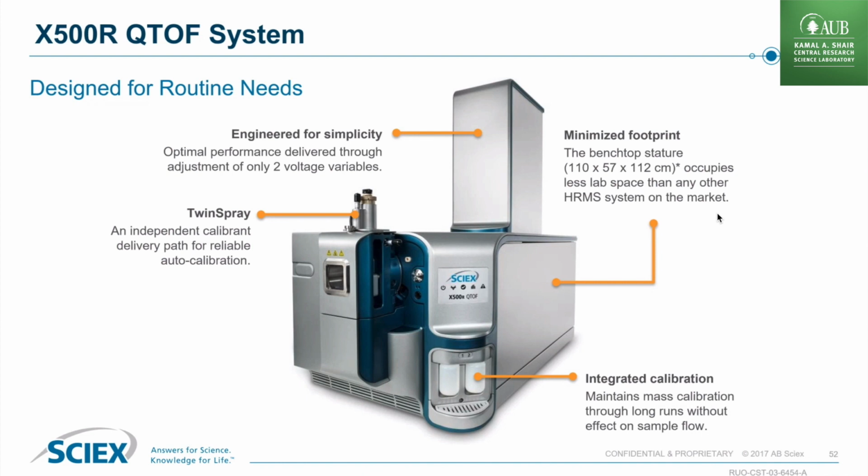Okay, so this is important. These last 2 points are important for training. The instrument has integrated calibration. Now, time of flight needs to be calibrated often. We recommend that it's calibrated once per hour.